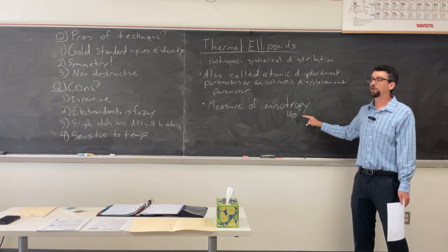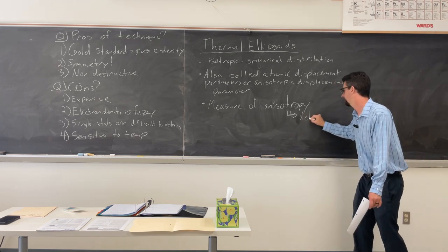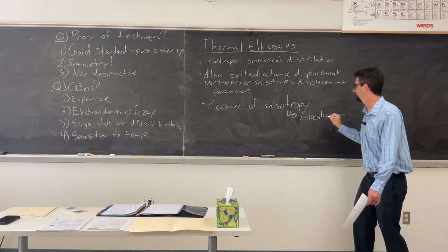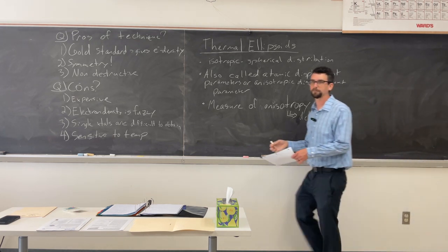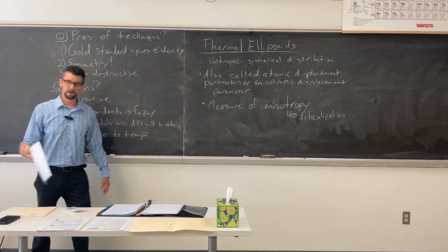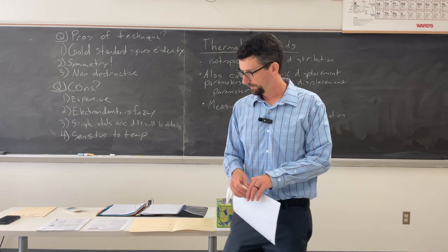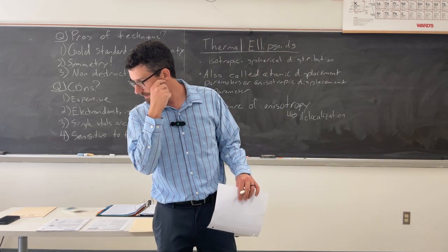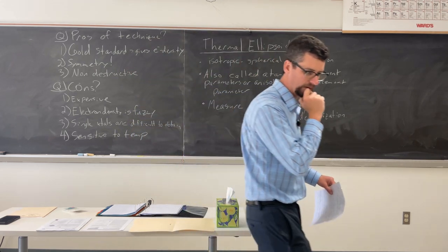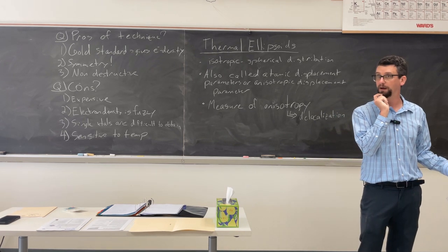What this tells you, though, is about delocalization. What do I mean by delocalization? Electrons are not where they're supposed to be. Right, an electron cloud, diffuse. So as you look at that structure, those are phenyl rings. If you notice, the hydrogens are kind of just plunked on there. The hydrogens are not actually known in this system. They just guess they're there.